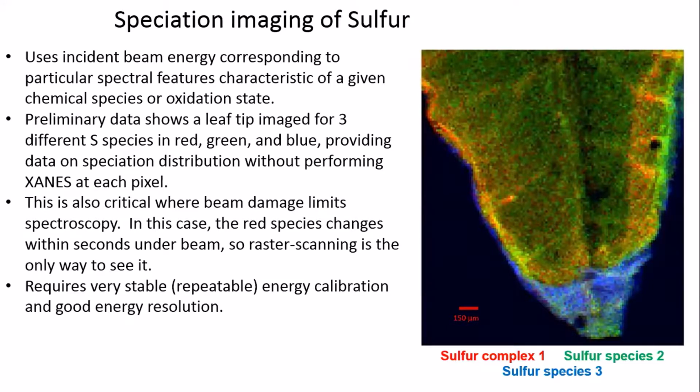I do keep an eye out for it in everything I look at. Most of the geological or meteorite samples, we don't see beam damage on the scale of the measurements that we make. TES does have a lower flux than XFM. I know XFM is a very hot beamline, so that it's already got an advantage there.